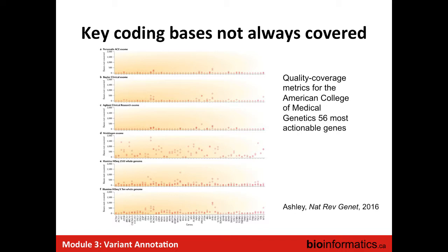As Mathieu mentioned, we're part of a project where it's used in the clinical context, and waiting 2 weeks to get that answer is an issue. So we have to sort of trick the pipeline and use only a subset of the whole genome data to get an answer faster. Instead of mapping all the reads to the whole genome, we only map them to the exome, the coding regions, or even to a subset of actionable regions, so we get an answer faster, and then we wait for the full answer 2 weeks later. But the time it takes can be an issue with whole genome sequencing for sure. And it's funny because you're generating all that data, and then anyway you filter it down to the genes. So for some applications it makes sense, instead of mapping to the whole genome, which takes time, to map just to the genes.